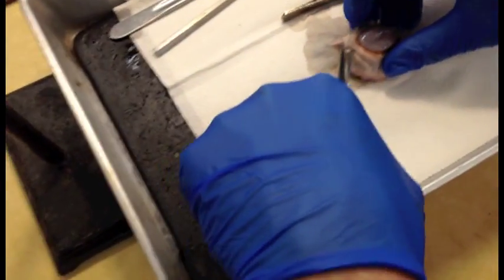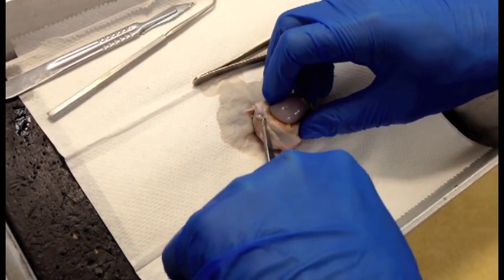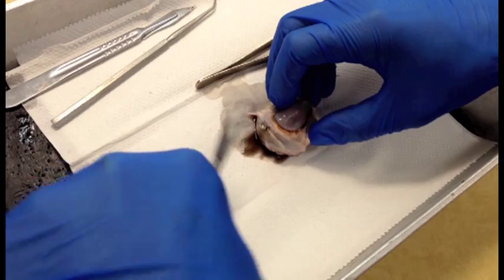That's the aqueous humor. The aqueous humor is the fluid that fills the anterior chamber, right underneath the cornea. It's very watery, as the name suggests. You can see more of it pouring out here. I'm just going to keep going around, all the way around.